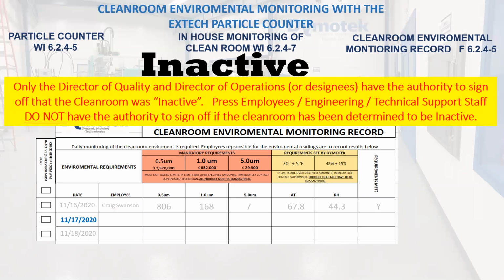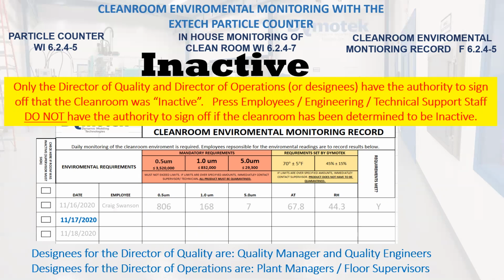Press employees, engineering, and technical staff do not have the authority to sign off if the clean room has been determined to be inactive. Designees for the Director of Operations are the plant managers and floor supervisors, and the designees for the Director of Quality are the quality manager and quality engineers.